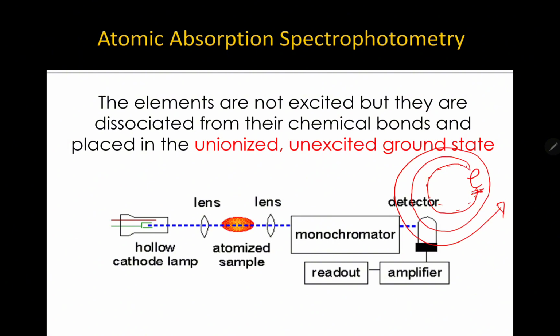Okay? So, para mas madali siya maka-absorb ng light, ang purpose lang ng flame dito is to convert the sample aerosol into atomic vapor. Not to excite the light. Okay? So, kapag nagawa na ng flame yung trabaho niya, na-convert niya na yung sample aerosol into atomic vapor, ngayon, the vapor now, or your sample, can absorb light directly from your primary light source.